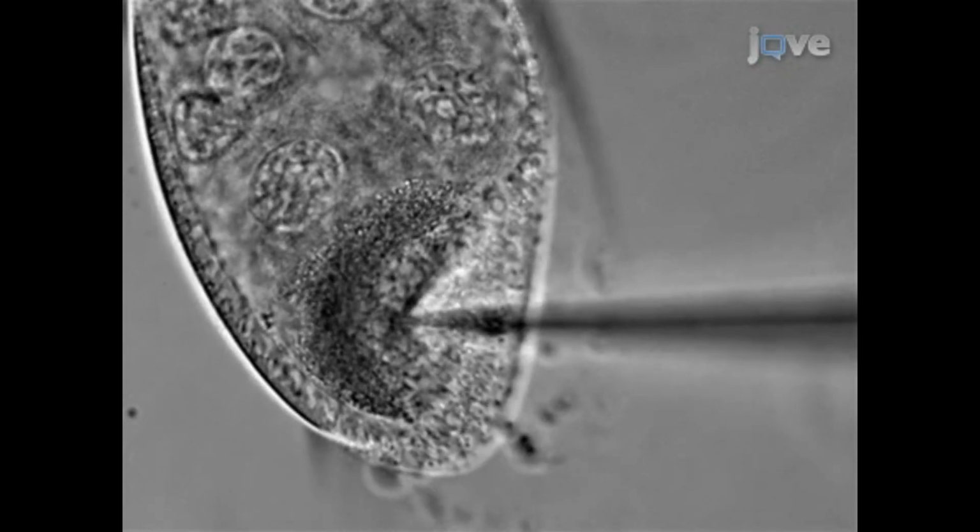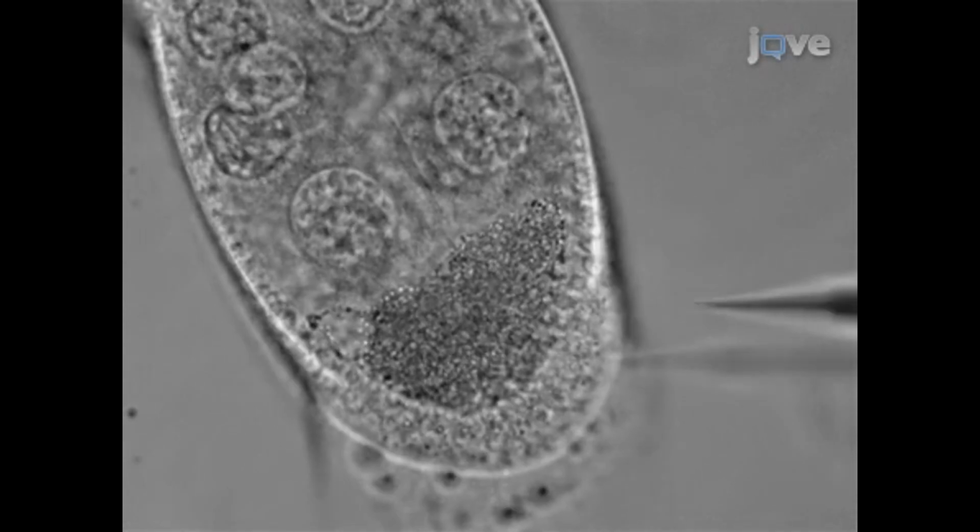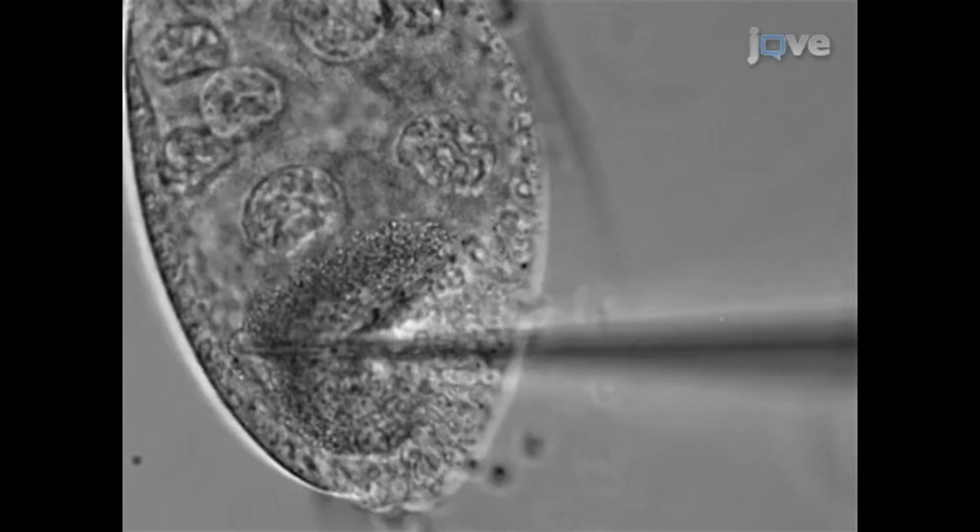If a mistake is made, move to the next marked oocyte. Do not waste time on damaged oocytes.